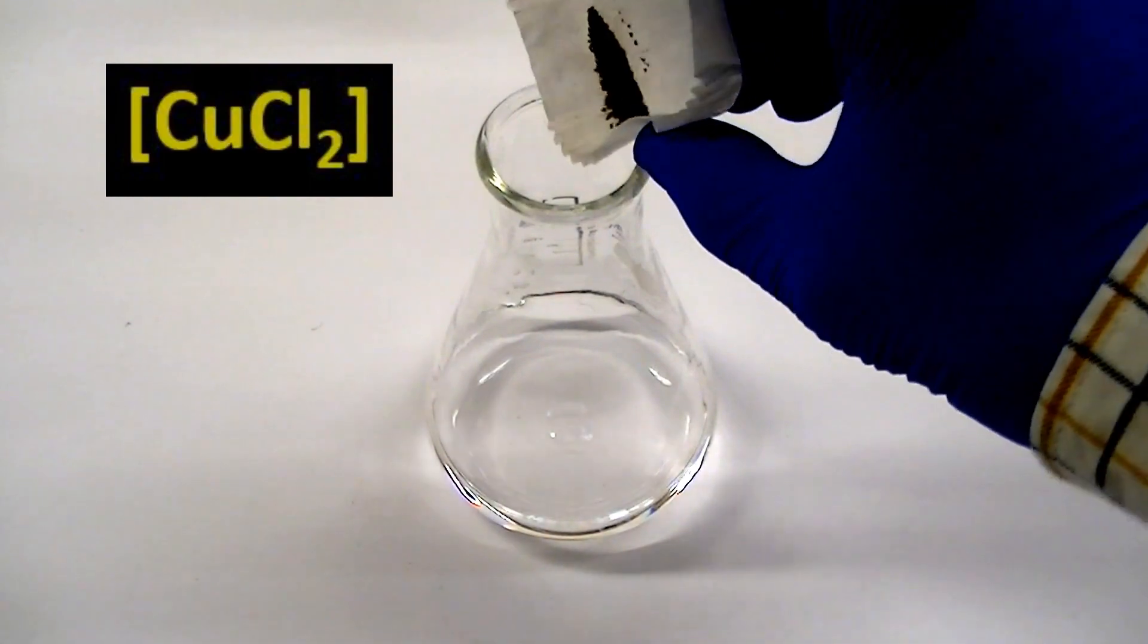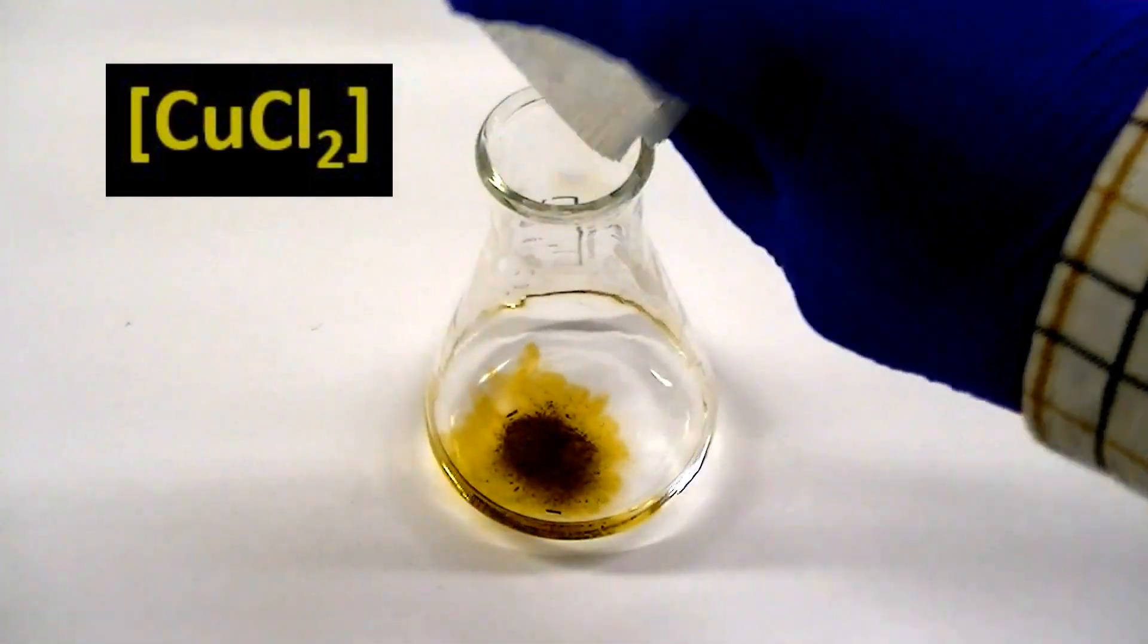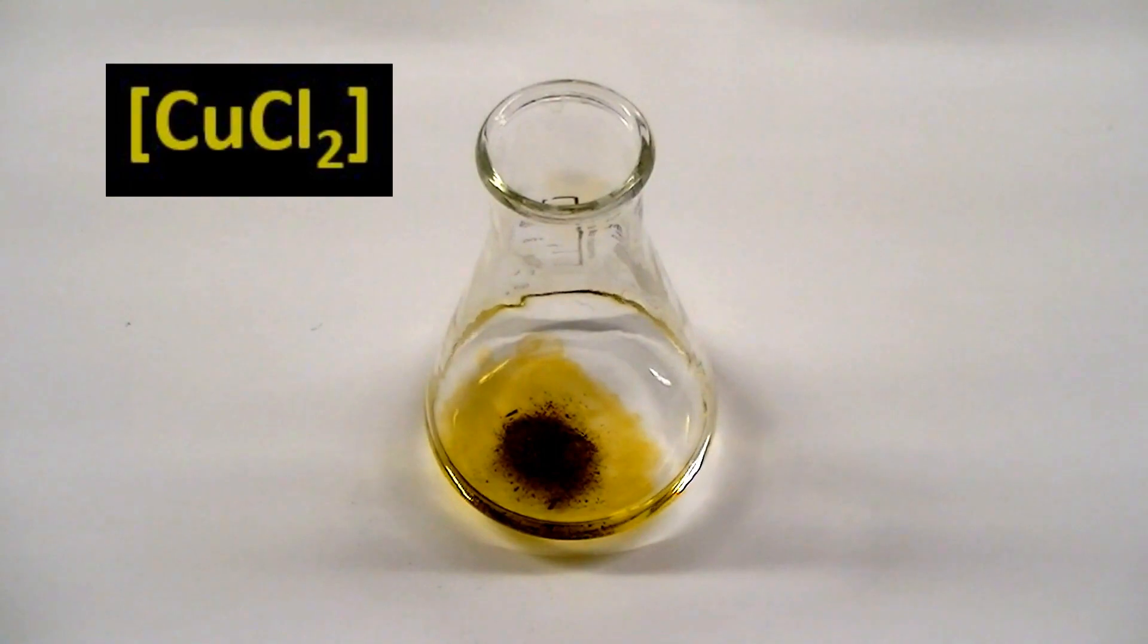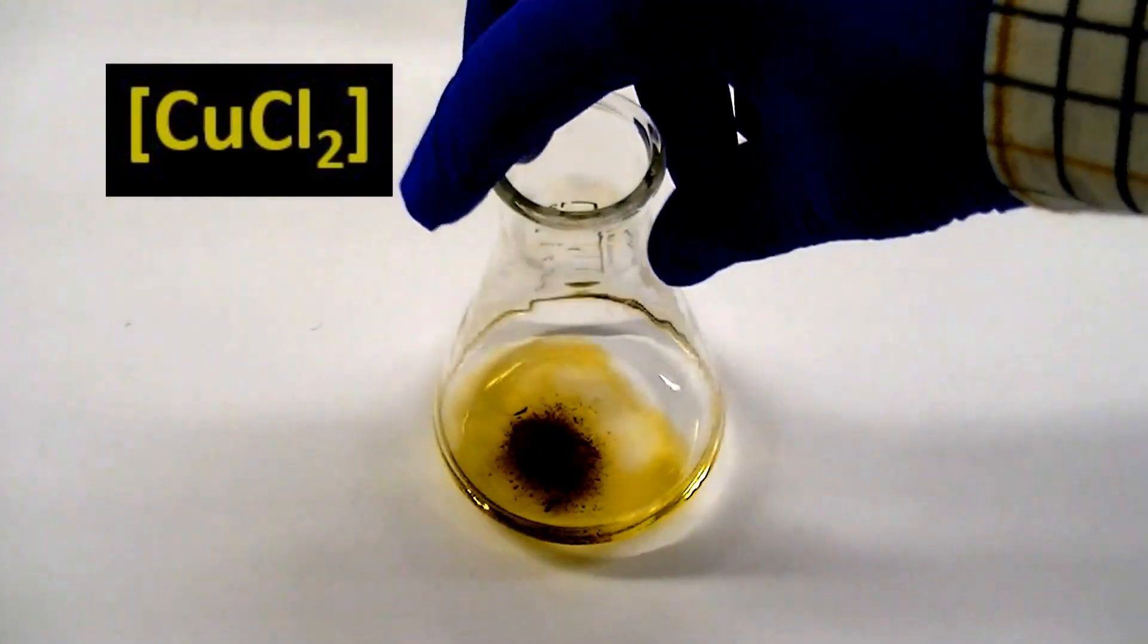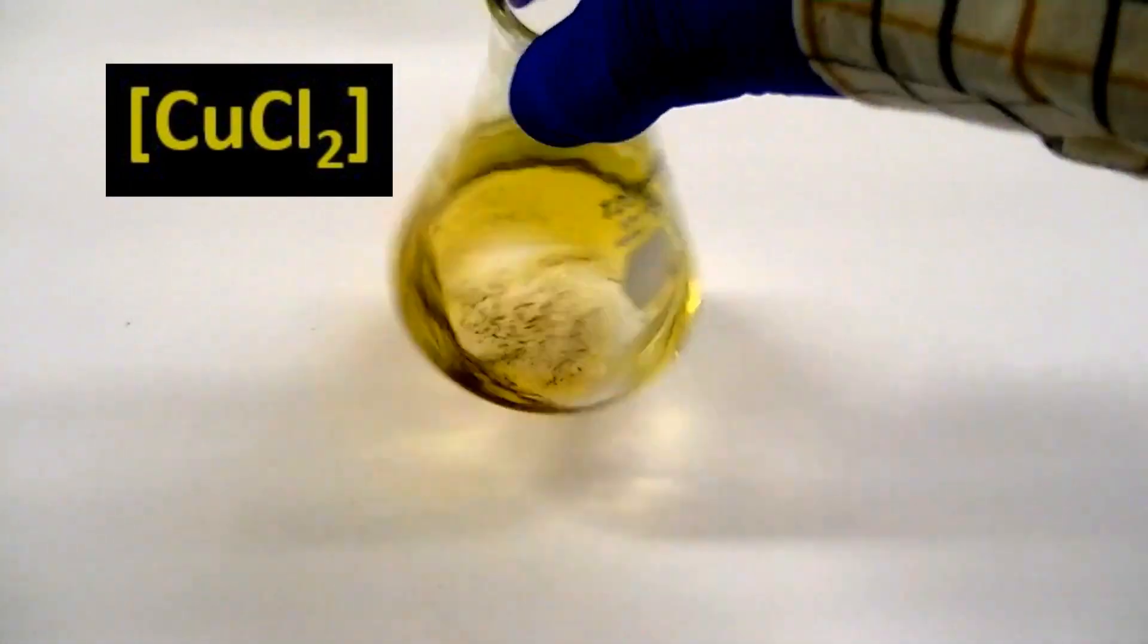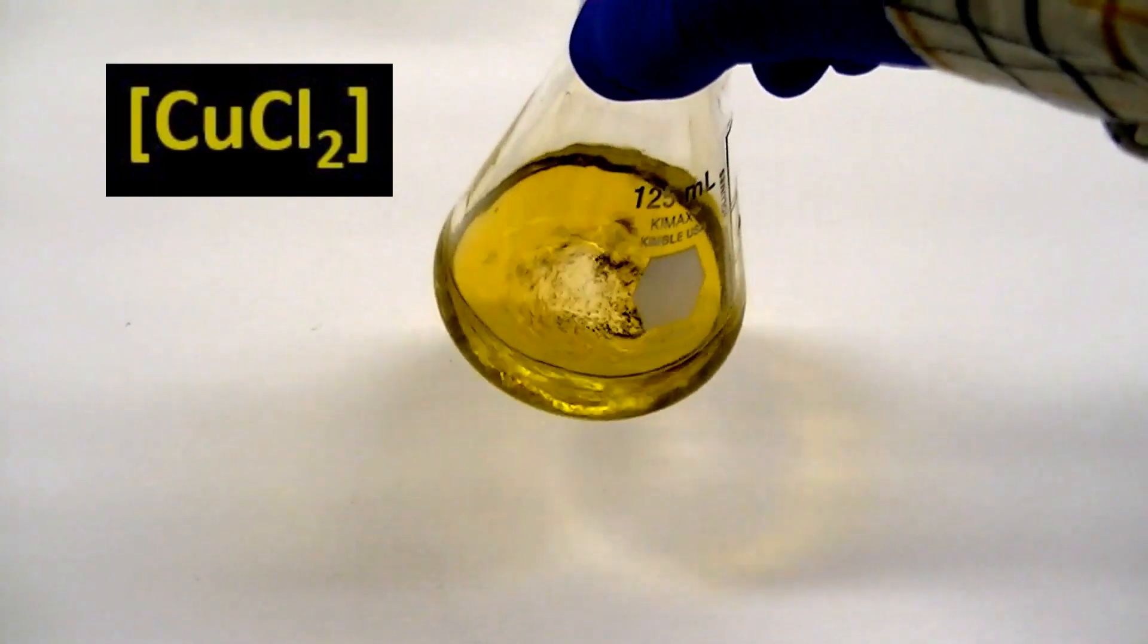To prepare the system, we simply dissolve anhydrous copper II chloride in acetone. The resulting solution has a dark yellow-green color, which is indicative of a dichloro-copper II complex.